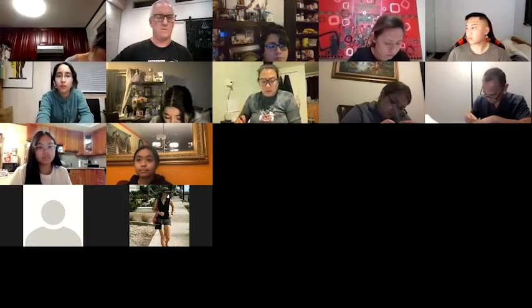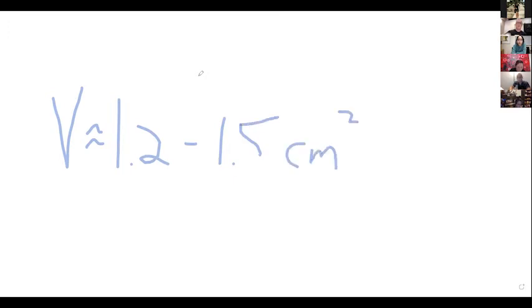But when you do your calculations, let me put up a screen here. When you do your calculations, you should get a volume between around 1.2 to 1.5 cubic centimeters. It should be somewhere in that vicinity. So remember, don't use millimeters.